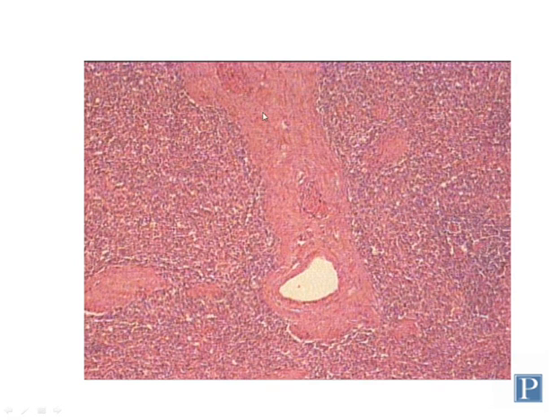This kind of looks like the wall of an artery, but in fact this is a trabecula, and arteries pass through trabeculae initially, and trabeculae are not surrounded by a periarterial lymphatic sheath. So here's the lumen of an artery that's surrounded by the trabeculae, but we don't call it a central artery in this case, we call it a trabecular artery.